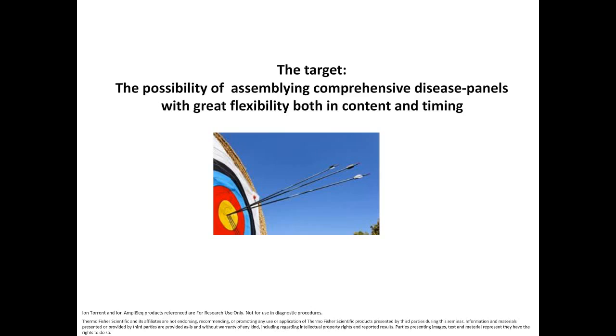We know that gene dosage has always been a problem, so we cannot address gene dosage with sequencing, but next generation sequencing has the capacity of reading with enough depth that we are getting there. Now, what we didn't expect, at this extension, is that we had to deal with somatic mosaicism, and it's becoming more and more clear that even with Mendelian disorder, this is a problem we have to address.